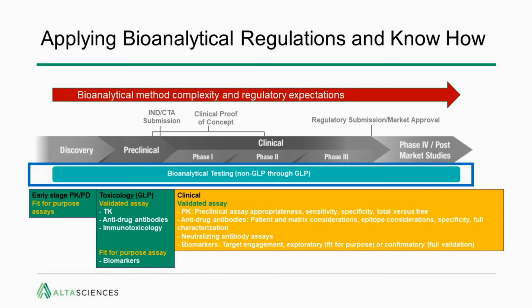Anti-drug antibody assays are also required to be validated, and these also present distinct challenges from the preclinical toxicology assays, because now we're dealing with patient and matrix specific considerations that are novel, as well as the need for further characterization of epitope specificity of the immunogenic response, as well as full characterization. Neutralizing antibody assays are also required at this stage in development and need to be validated.